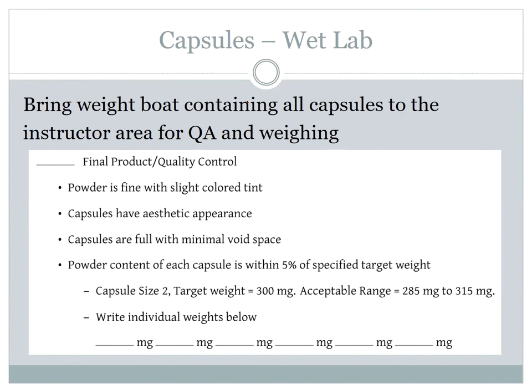All right. So here's the deal. You are graded on your worst capsule. So if you have 5 capsules that are right at 300 milligrams and 1 capsule that's 240, guess what? You get 0 points. Your grade is based off of your worst capsule. Again, I'm not having you make 100 of them. You're only making 6 of them. So you need to get 6 good ones. So again, you're graded on your worst capsule. It will not be an average weight. We will weigh them individually.